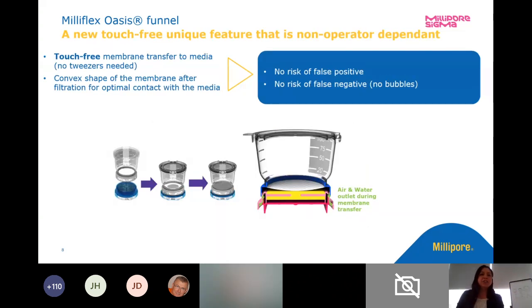We still have that touch-free device, so we don't need to transfer the membrane. There's no forceps needed to transfer a membrane if you've done other manifold testing in the past or are currently doing it now. The base of the funnel is incorporated into the funnel, so when we put that on the filter head, that's the only part that gets left behind. After filtration, we leave behind the convex shape of our membrane that comes in contact with our media.